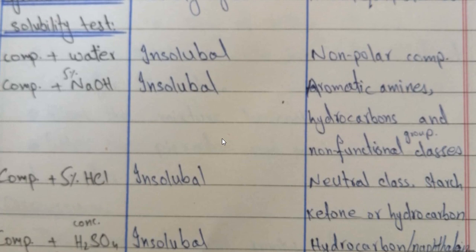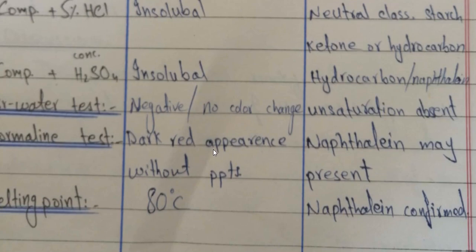Now we do solubility tests. We take the compound and add water in a test tube with a minute amount of compound — it is insoluble. We then add 5% sodium hydroxide — this will also be insoluble. Insoluble in sodium hydroxide means aromatic amines, hydrocarbons, or non-functional group classes may be present. We then test with sulfuric acid — Component A is also insoluble. This indicates hydrocarbons or similar neutral class compounds.